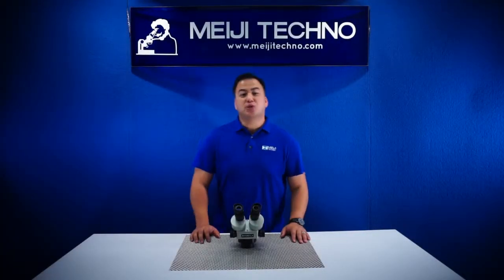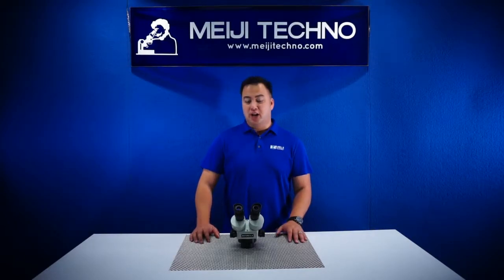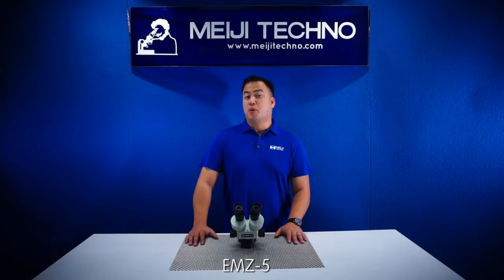Ohayou gozaimasu! Welcome to Meiji Techno. Today we'll be discussing our most popular model, our EMZ5 from our EMZ Zoom Stereo Series line.